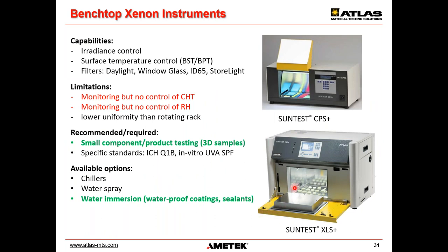We can quickly go through the benchtop instruments. The benchtop instruments have nice solar simulators inside and nice temperature controls, but typically they don't have humidifiers. So you have an instrument without humidity control. This is oftentimes good enough, I would say, but not for everything. When you go to very sensitive materials, like thin materials or printing inks and labels, they react to humidity quite strongly. So you should respect how far you can get with the benchtop instruments.